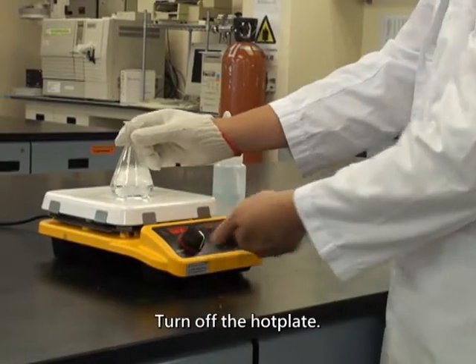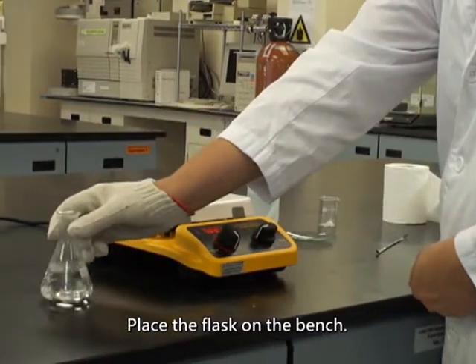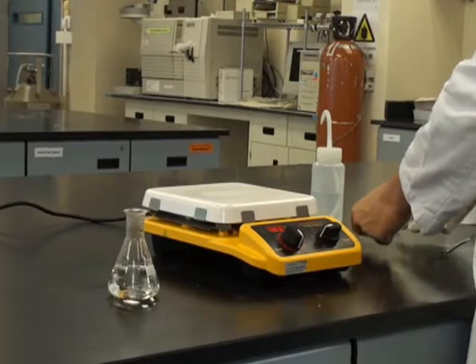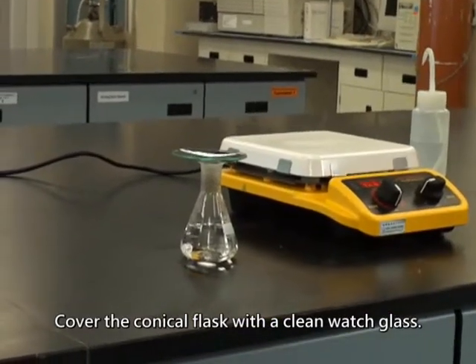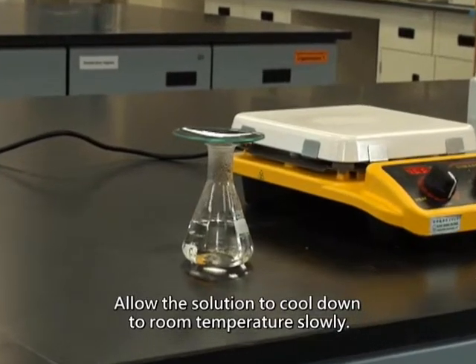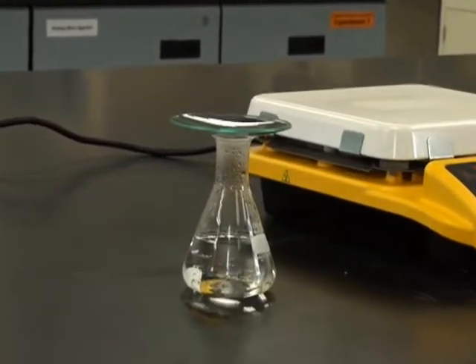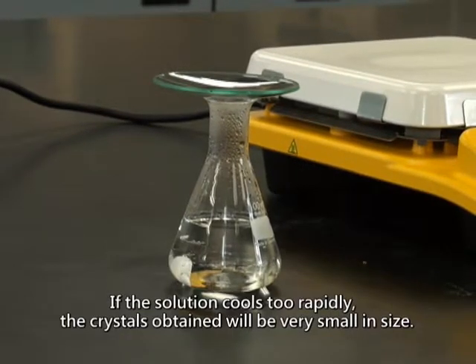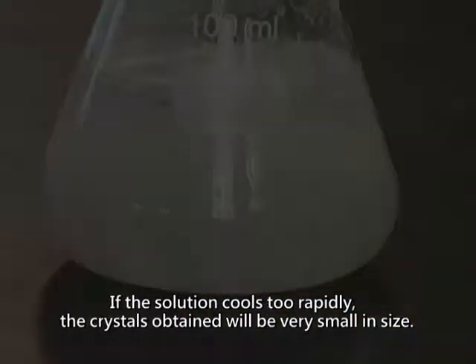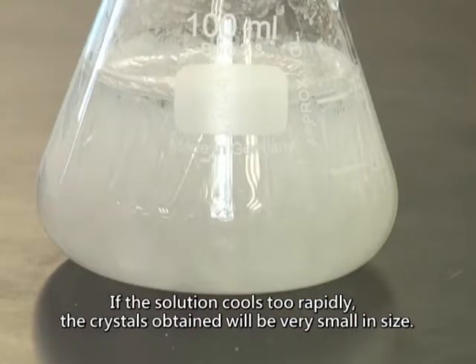Turn off the hot plate. Place the flask on the bench. Cover the conical flask with a clean watch glass. Allow the solution to cool down to room temperature slowly. Do not disturb the solution when the product crystallizes. If the solution cools too rapidly, the crystals obtained will be very small in size.